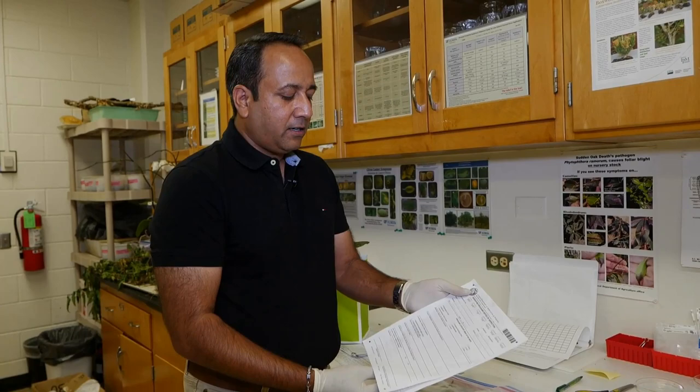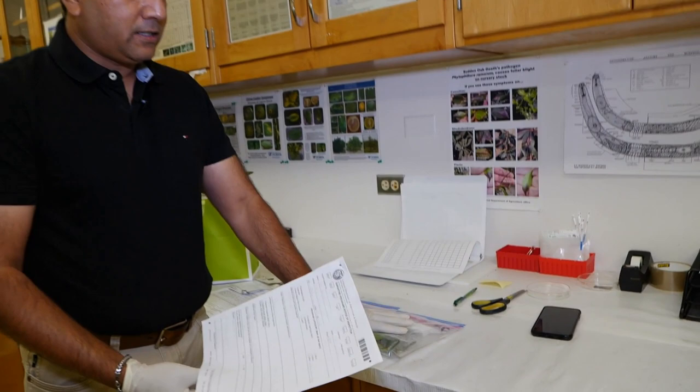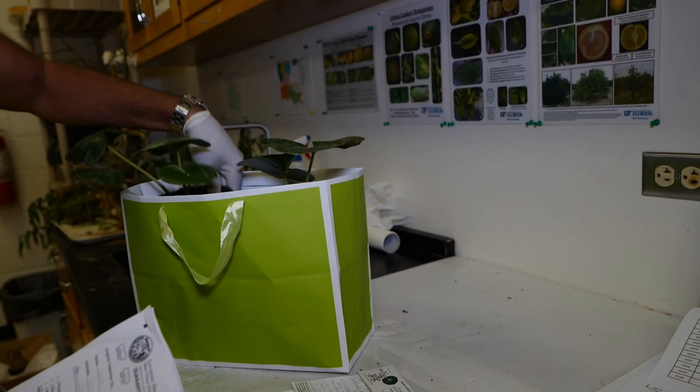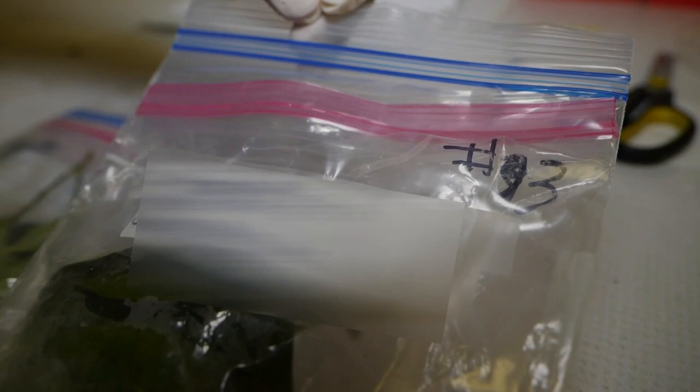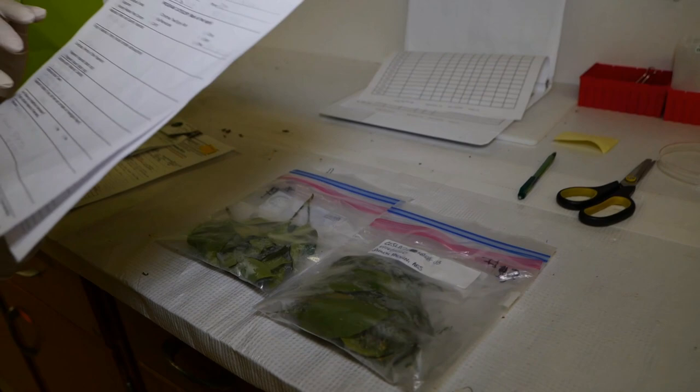Here is another example of a sample that's been collected by Department of Agriculture and Forestry. This is a regular sample, this is a quarantine sample. You can see the difference - this just came in in a regular gift bag, but this sample has a number, collection number and everything, and it's double bagged.